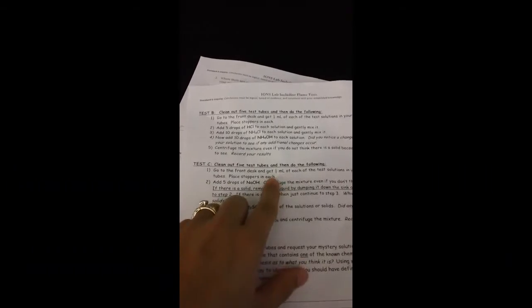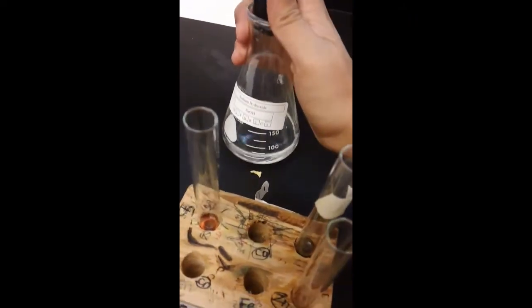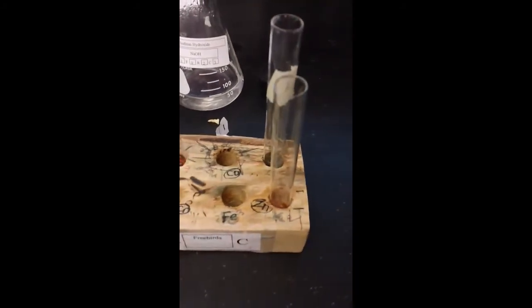Okay, so for test C, for number 1, I already have my solution, so I don't need to do step 1. I need to add 5 drops of NaOH and centrifuge. So we're going to head over to the NaOH. Okay, we're at NaOH, double checking our bottle, making sure it's NaOH. And now we're going to add 5 drops of it to our new solution. So we're working with our new test tube C for test C.